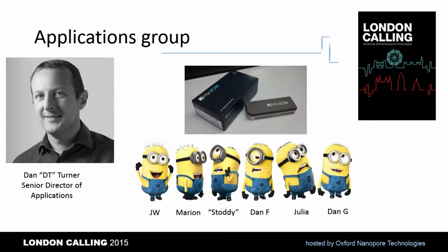The applications group explores and demos uses that were previously difficult, if not impossible, with existing short-read, fixed runtime technologies. We exploit the natural advantages of nanopore sequencing on the MinION platform. It's portable, it's single molecule, it's long read, and it's real time.